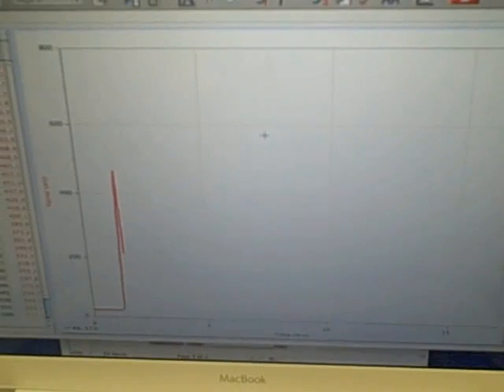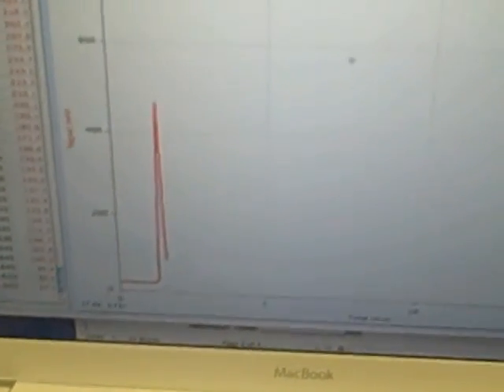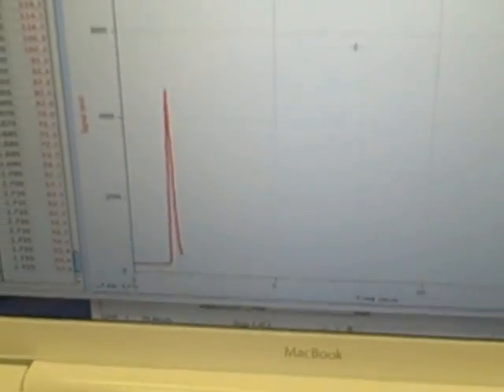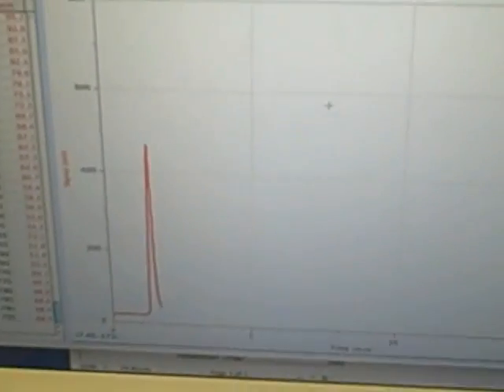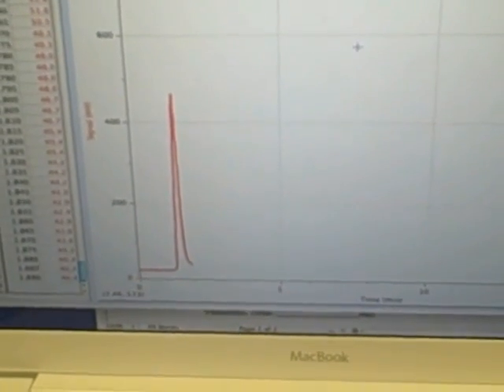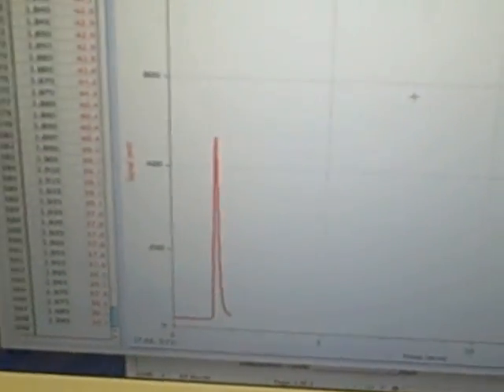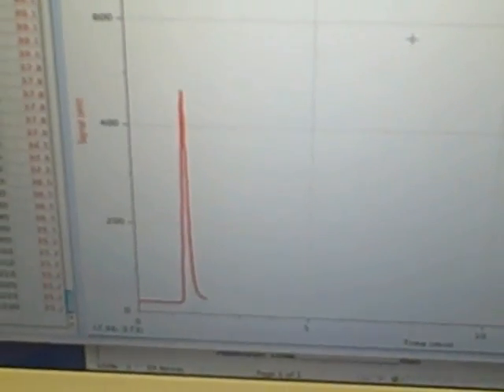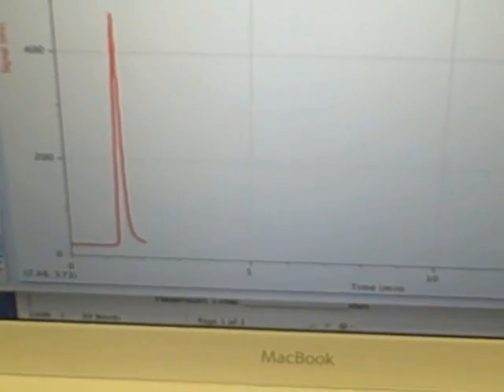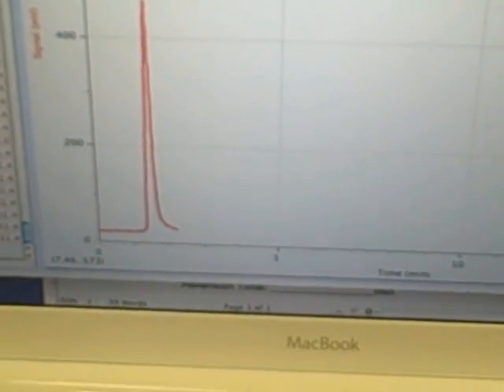We now see what the retention time is for ethanol. In fact, all 6 of these chemicals have a different retention time. That is how you are going to identify which material you have. Some of these materials will require the entire graph. This particular one does not. So as soon as the graph is flattened out, probably 4 to 5 minutes, we will stop data collection and move the graph to our data sheet.